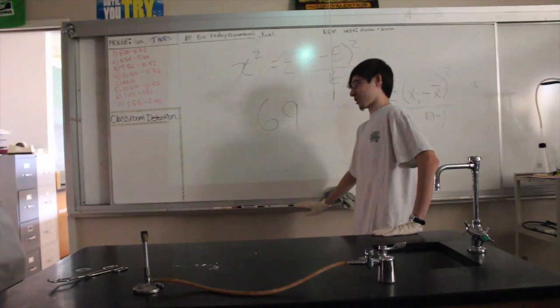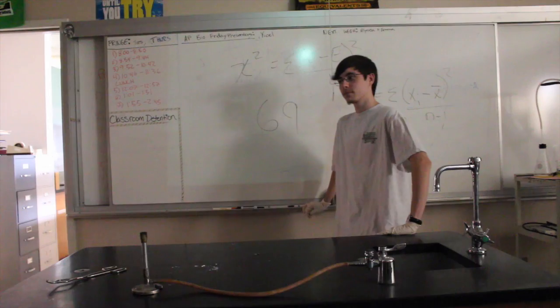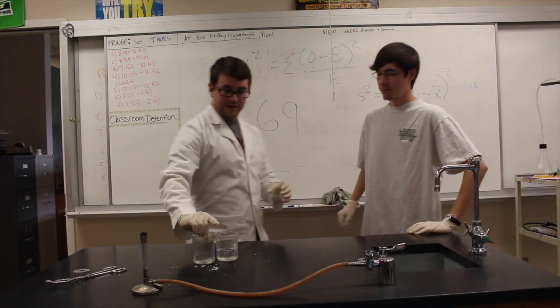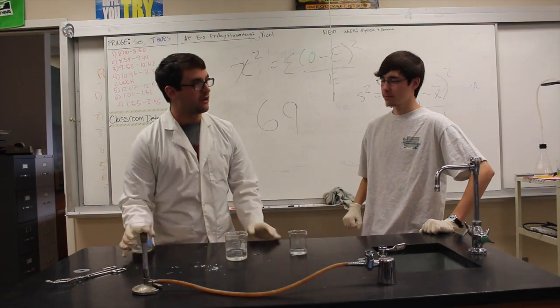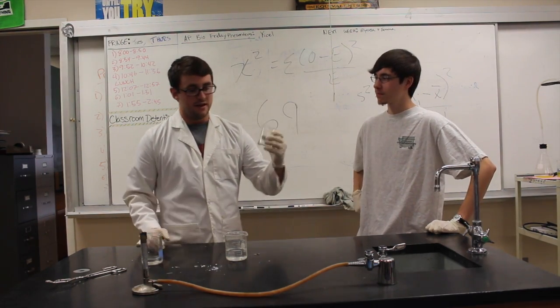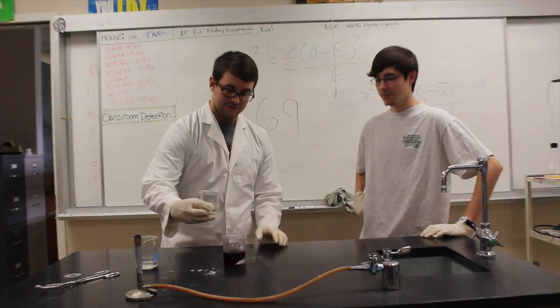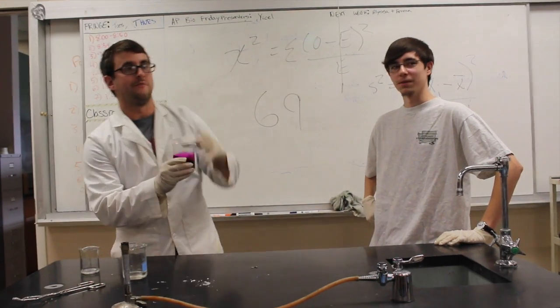Alright. I suppose let's head on to titration then. Titration. Okay, you want to turn on the lights, Joe? Okay. This one's a little interesting. We got 3 clear liquids here. They all look like water. You don't want to drink any of these. For example, if I put this in here, whoa! It's dark purple. Yeah, we already did this.